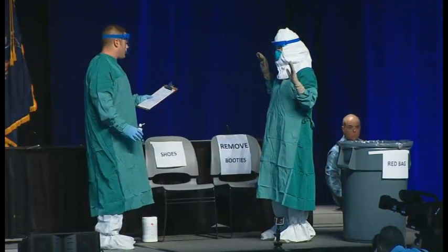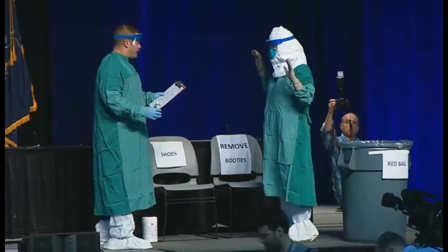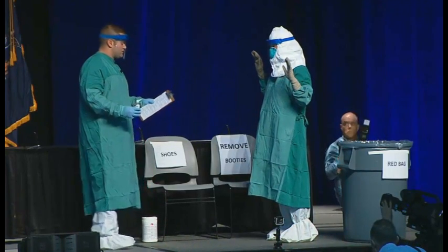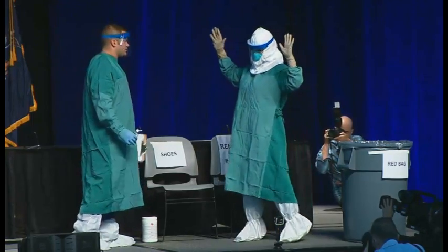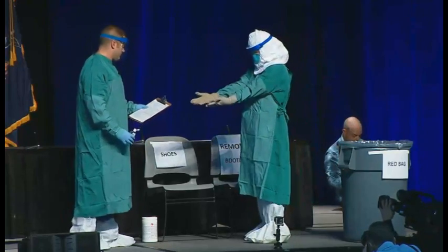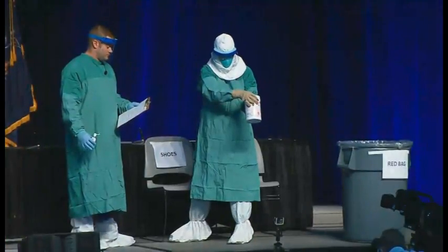Now that Barbara is done providing patient care, as her trained observer, I'm there to help her get her PPE off safely and discard it in an appropriate waste container. Barbara is going to turn around and I'm going to inspect her PPE, make sure she has no visible contamination, cuts, or tears. If there was visible contamination, she would use a wipe to decontaminate the external surfaces — one of the new recommendations — before proceeding with removing the equipment.